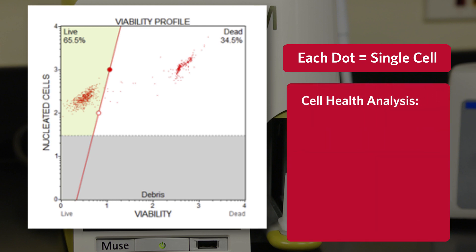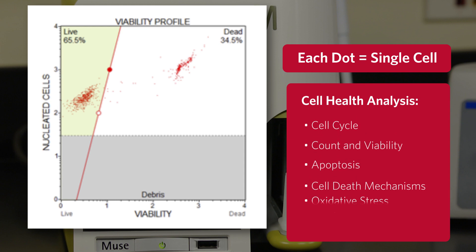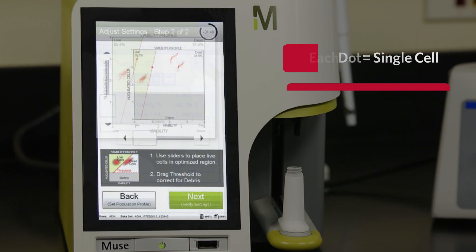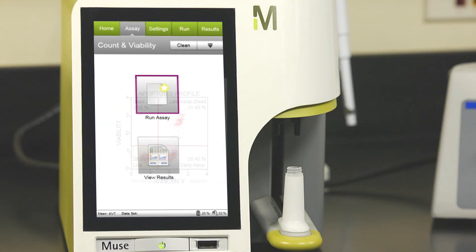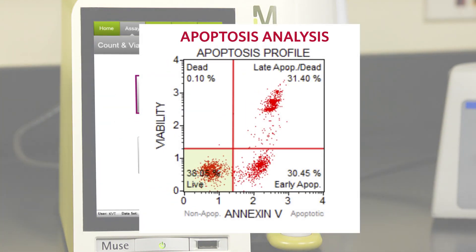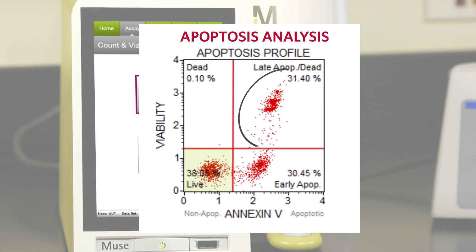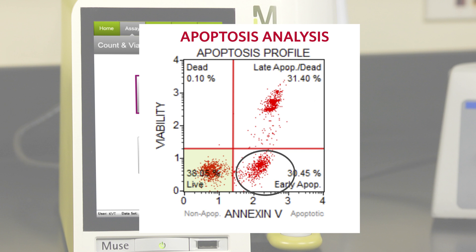For the analysis of cell health, Muse offers multiple kits to assess cell cycle, viability, cell stress, and more. In this example, a cell sample stained with the Muse Annexin-5 and Dead Cell Assay Kit returns single-cell data that is grouped into four distinct populations: live non-apoptotic cells, dead non-apoptotic cells, dead apoptotic cells, and early apoptotic cells.